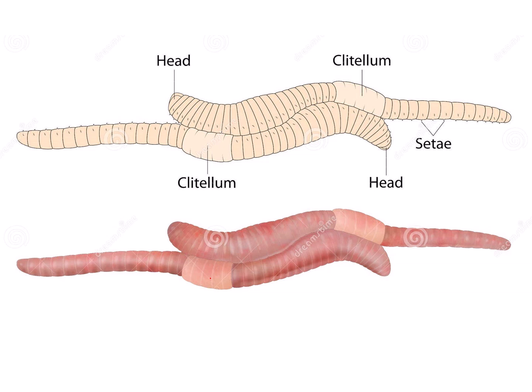The two earthworms align ventrally, and the head and the tail of the two earthworms are in opposite directions. The mucus from the clitellum of both earthworms keeps them bound. Mucus is a sticky glycoprotein material.